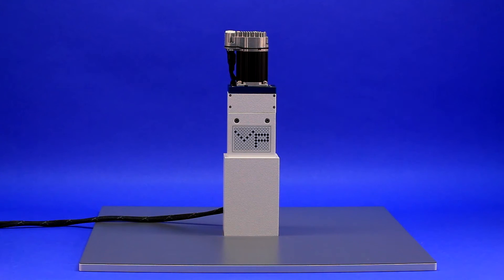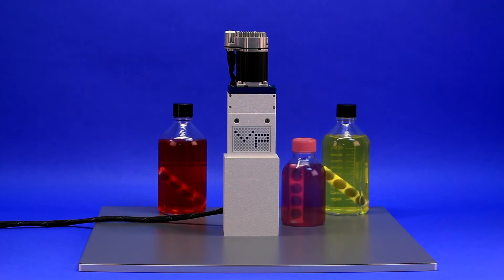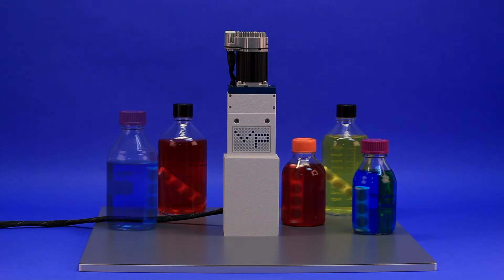You can also stand the stirrer upright with the optional stand to mix bottles. Using our paddle stirrer, you can see how many bottles can be mixed at once.